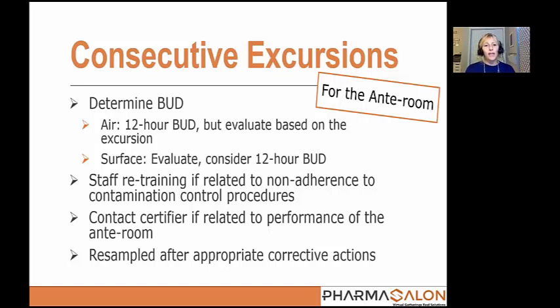If you think that the issue is related to the performance of the ante-room, you want to contact your certifier. But most of the time, it is not a facility issue, it's a people and behavior issue. So make sure you start your investigation there. Then you want to get resampled after you go through appropriate corrective actions.